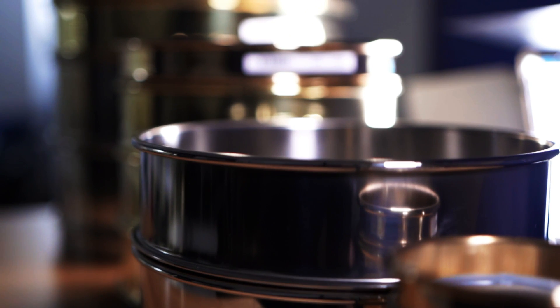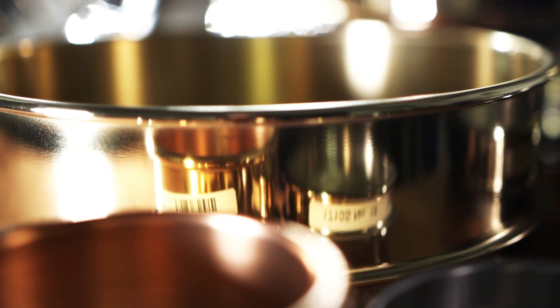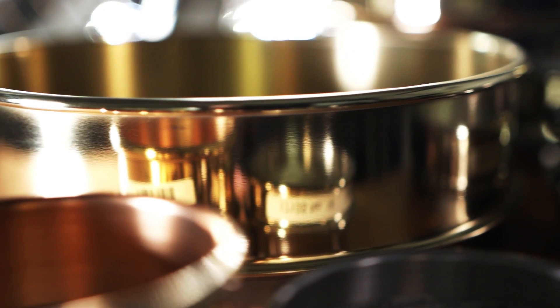Brass test sieves were the most widely available type in the beginning days of sieving over a hundred years ago. Many companies still order brass test sieves because they're just what they've always had in their labs. But with the expansion and affordability of stainless steel over the years, companies are finding it very beneficial to switch to the stainless steel varieties for the benefit of a longer lifespan. However, if you need something spark-resistant, brass is what you'll have to go with.